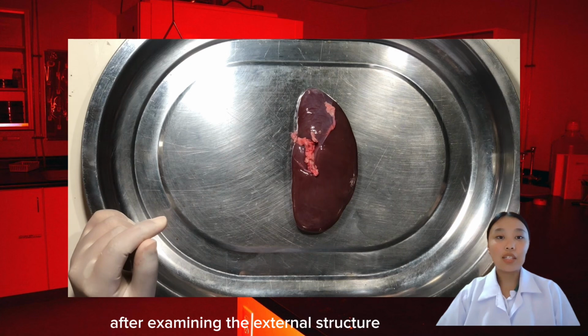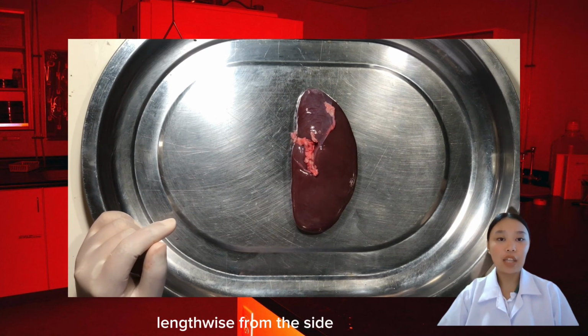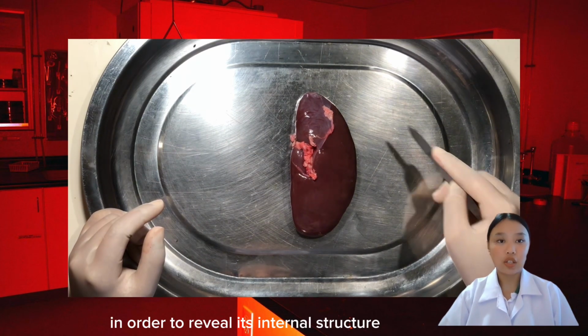After examining the external structure, let the kidney lie flat and cut it in half lengthwise from the side in order to reveal its internal structure.